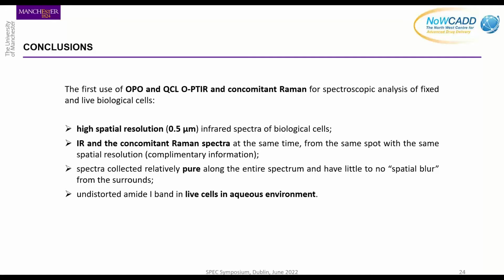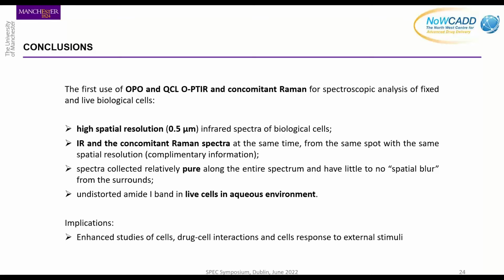We've got relatively undistorted amide-1 bands in live cells in water, which is amazing. So hopefully the implications are that we can start doing more enhanced studies of cells, drug-cell interactions, and looking at cells' response to external stimuli, which is our next stage.